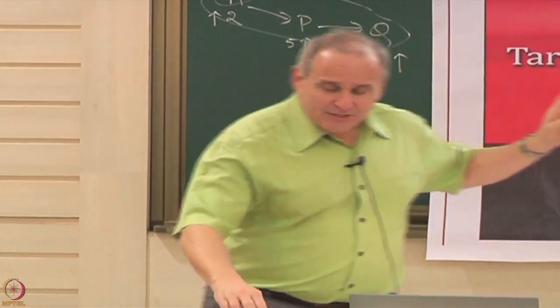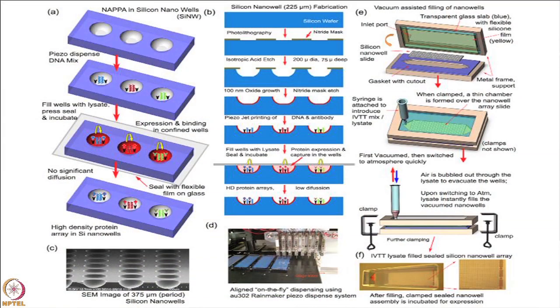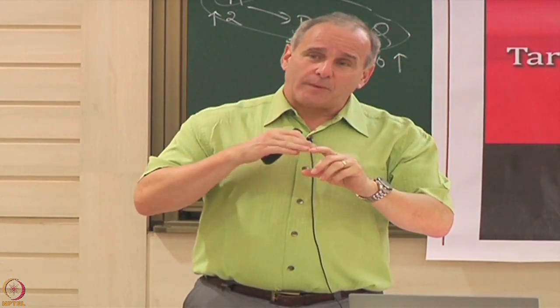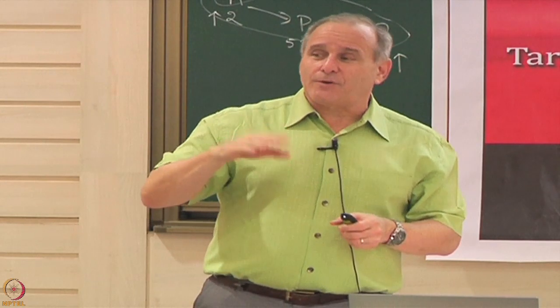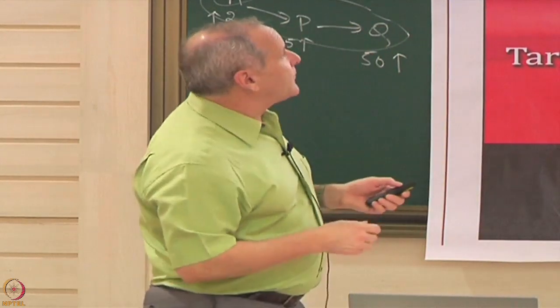One of the advantages of this platform is that we can print the DNA separate from the print mix, which means that we don't add the cross-linking agent to the DNA when we print it, which means that whatever DNA is left over, you can freeze it and use it another day. And so you don't have to waste everything that you've used. So that turns out to be an advantage to us.